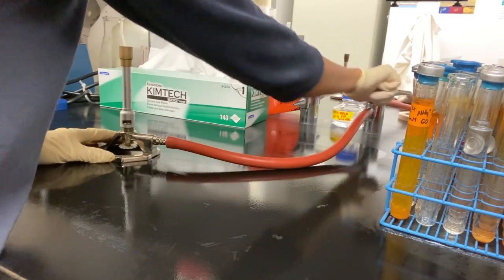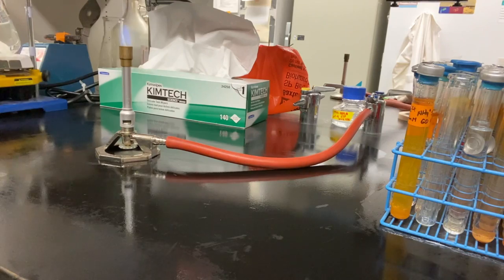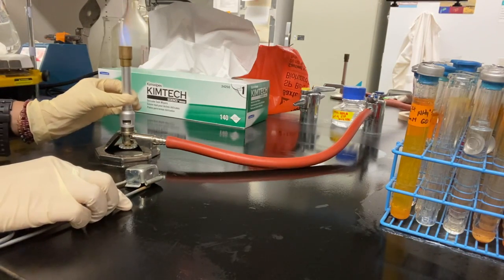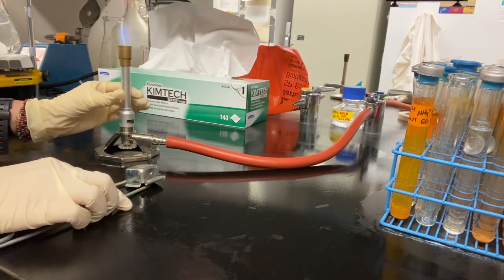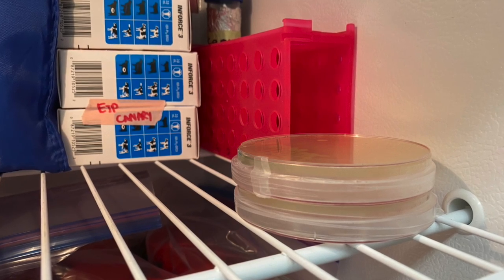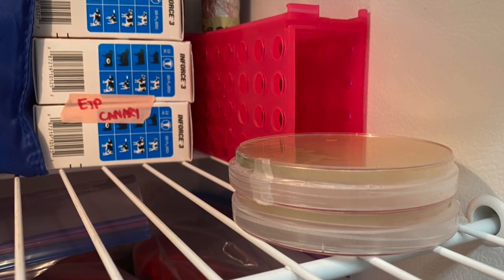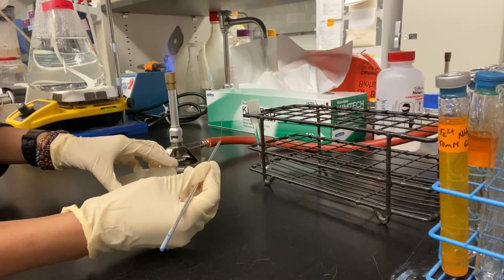Always using aseptic technique by wiping down our bench and lighting a Bunsen burner, we can grab an isolated colony from our streak plate and inoculate the isolated colony into 5ml of our MD solution.